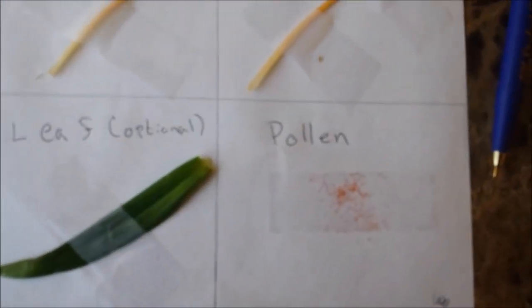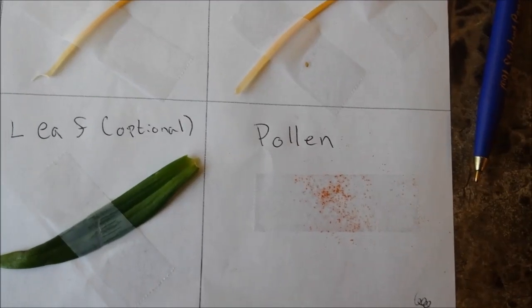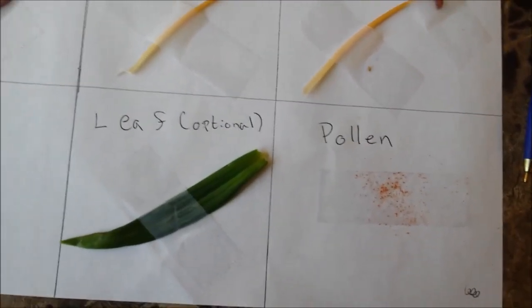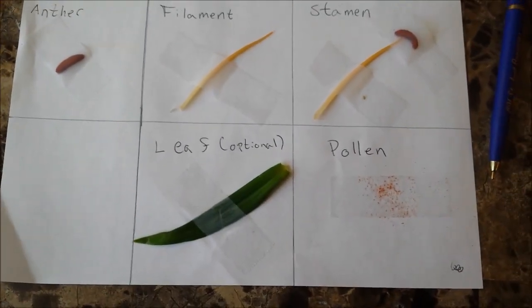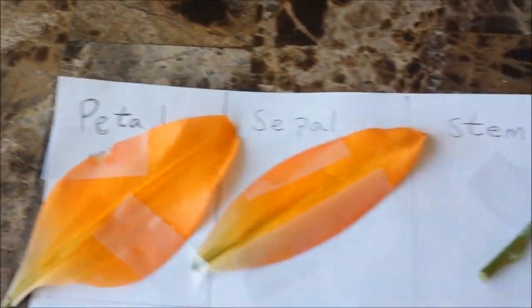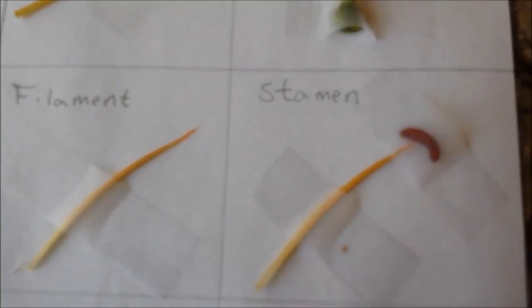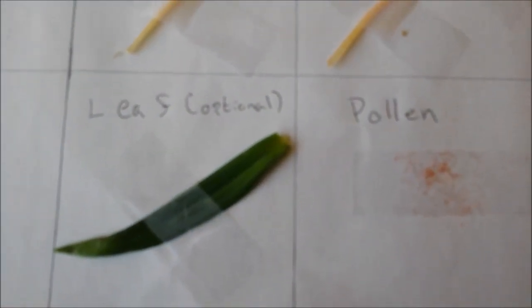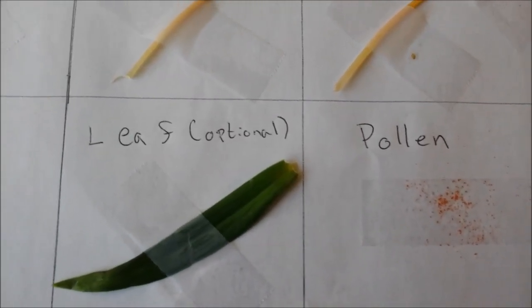You'll see down here I added pollen just as a little additional. Not all your flowers will have pollen, but some may. So if you'd like to add that, go ahead. If not, that's your prerogative. So you should have a petal, sepal, stem, ovary, style, stigma, anther, filament, stamen, and then possibly a leaf and possibly pollen if you had those on your flower. If not, that's okay too.